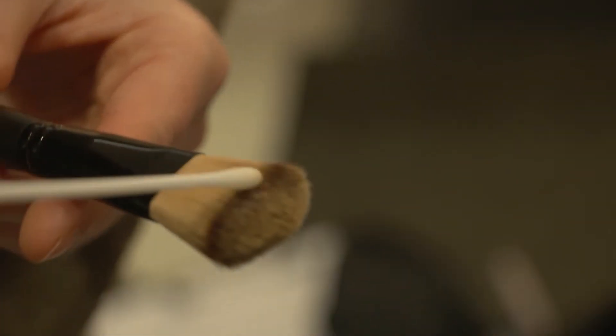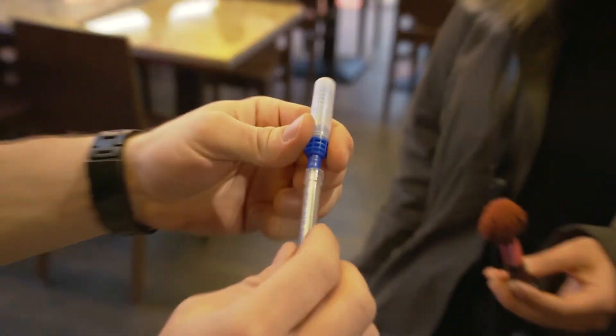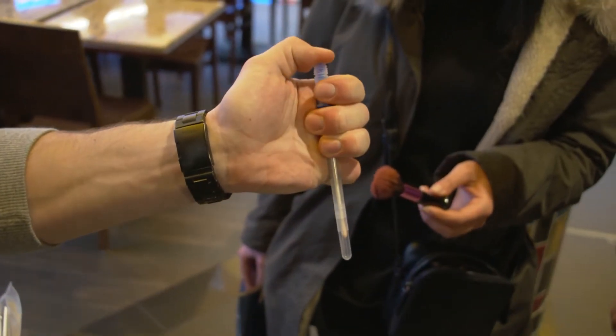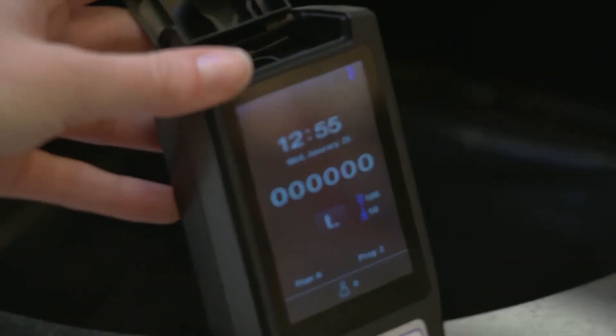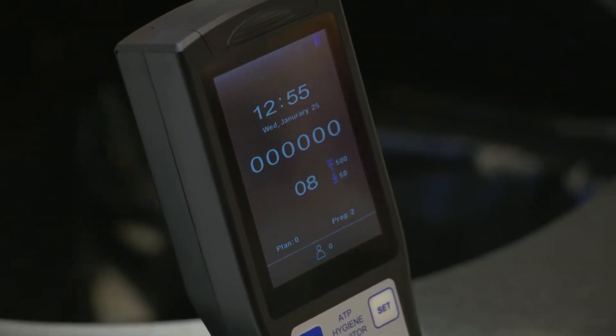PCE ATP-1 is a food hygiene tester, lumi tester, or luminometer used in the food, pharmaceutical, hygiene, healthcare, hospitality, and janitorial industries. This lumi tester allows for quick and easy adenosine triphosphate (ATP) surface testing and monitoring to ensure proper cleanliness.